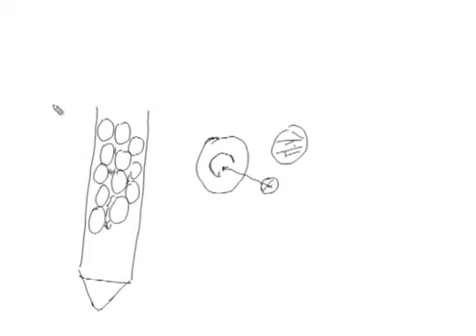So, this will come very fast, but the smaller molecule will spend more time because it will go back and forth as it travels down the column. It will move back and forth into the stationary phase and then the mobile phase. So, if you compare different sizes of molecules, if I say there is one size, there is another size, there is another size, there is a larger size, then all of these molecules, according to their molecular mass or molecular weight, will spend relatively different times: the smaller the longest time, the largest the least time, and in between they will be spending different times as per their size.